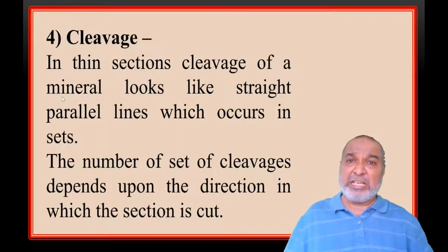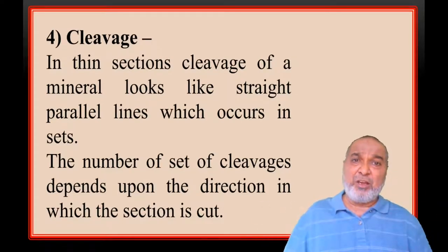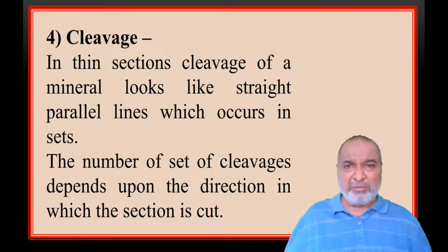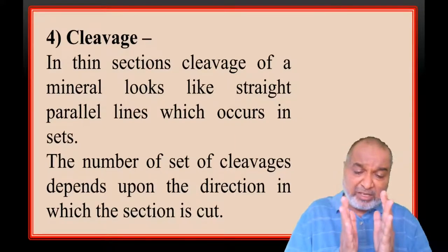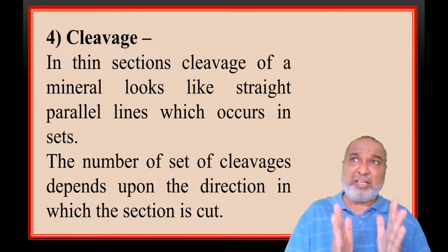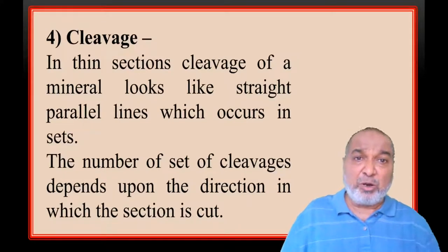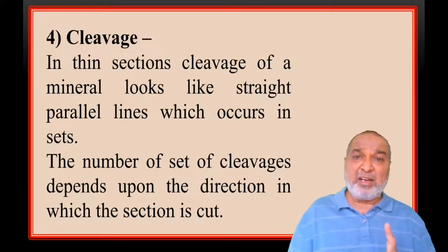Next one is cleavage. Cleavage is a plane of weakness along which the mineral can be split with a smooth surface. This is a definition we have seen in megascopic minerals. Similar, but here it is not the definition. What do we have to observe under the microscope? There is a set of straight parallel lines. They may be long or short, but all are parallel together. This is called cleavage.